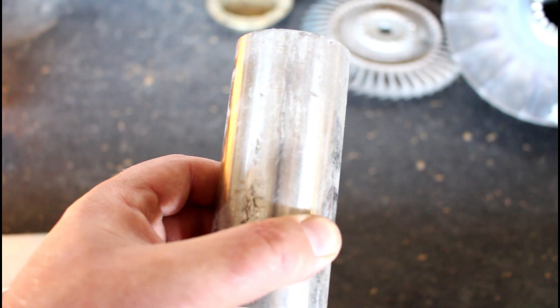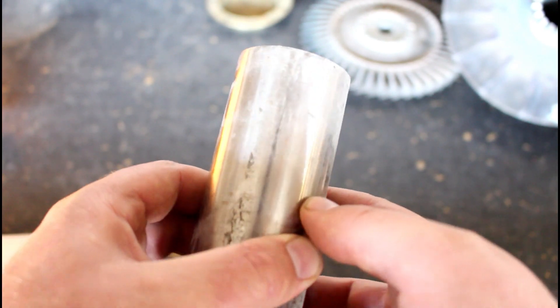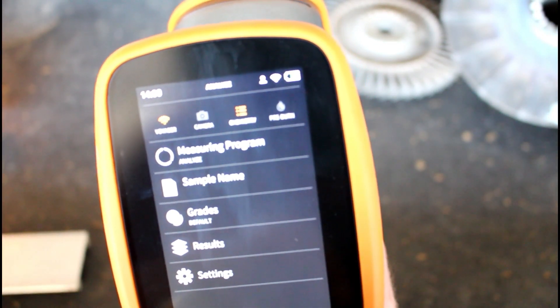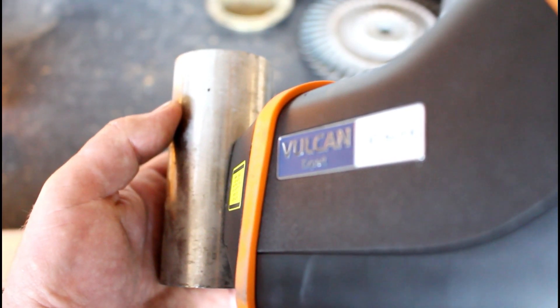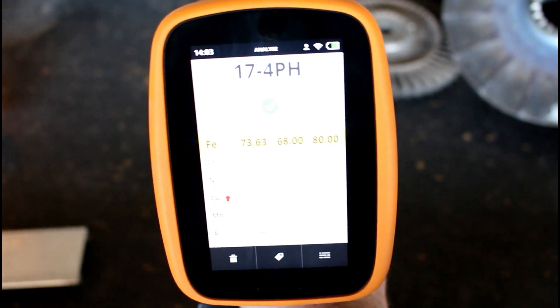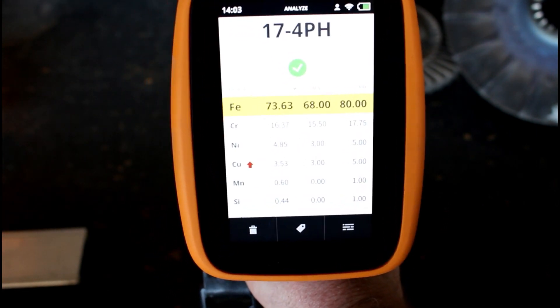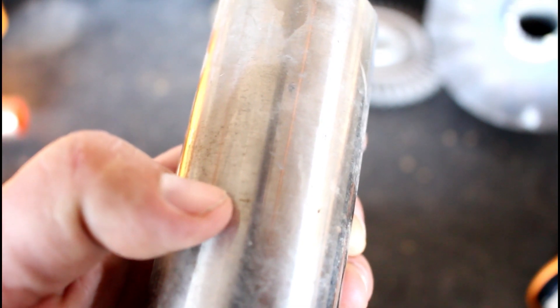Here's something else I like about this gun — it has a pre-burner. So if you have an item like this that's got dust on it, it actually burns through that dust to give you an accurate reading. All you gotta do is swipe down the touch screen and hit pre-burn. So we got the pre-burn turned on, I'm gonna put it up here, watch how fast this is. Done. 17-4. That's stainless — a certain type of stainless. That little spot right there is where it pre-burned it. It doesn't make a very big indentation, but that was just to get through the dust and get a good reading.